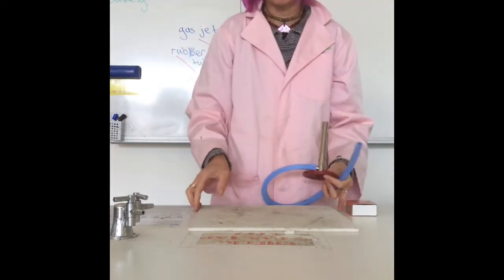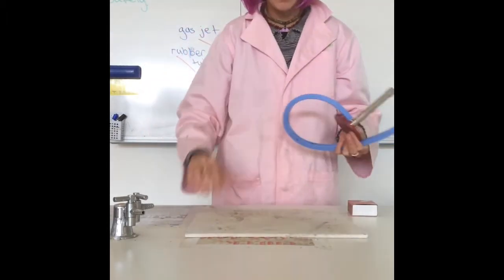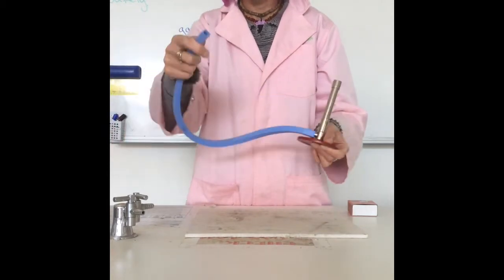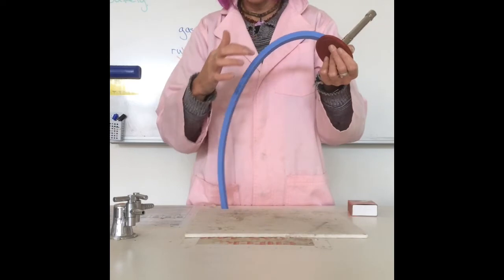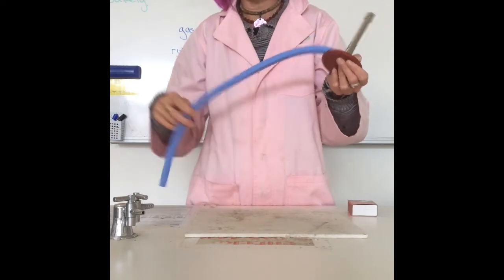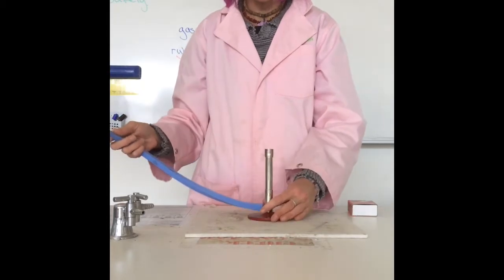The next step is to get your heatproof mat. And you're going to check the rubber tubing for cracks. This end and this end is really important to check. And if there's a curve in it, always along the curve, there are places where it might crack.